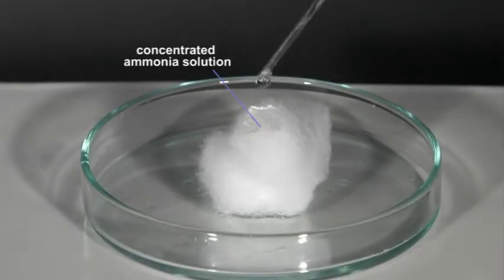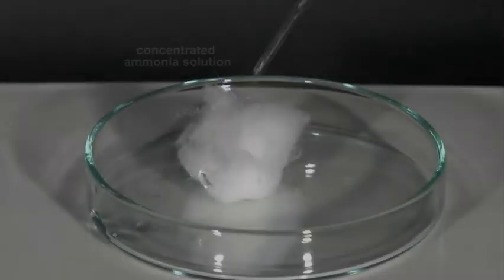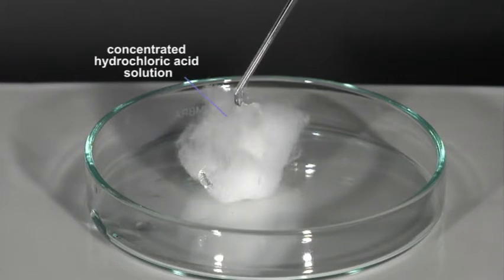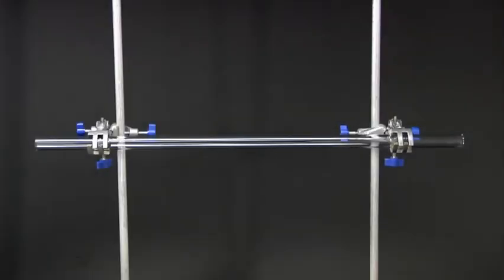Cotton wool is soaked with a little concentrated ammonia solution. A second wad is similarly treated with concentrated hydrochloric acid solution.